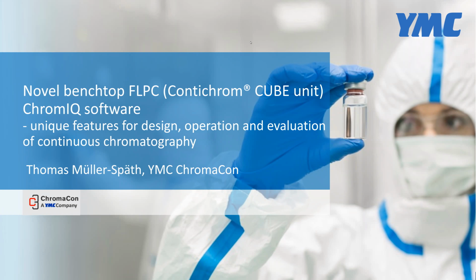Hello, everyone. My name is Gerard Gatch, and I'll be the moderator for today's webinar on the topic of novel benchtop FLPC, the Contichrom CUBE unit, ChromIQ software, its unique features for design, operation, and evaluation of continuous chromatography.